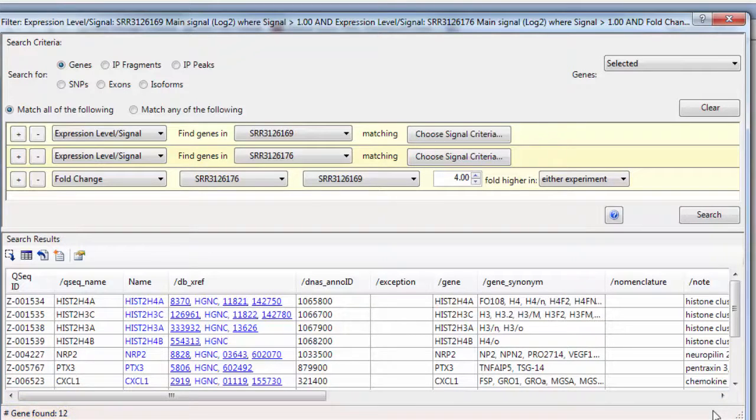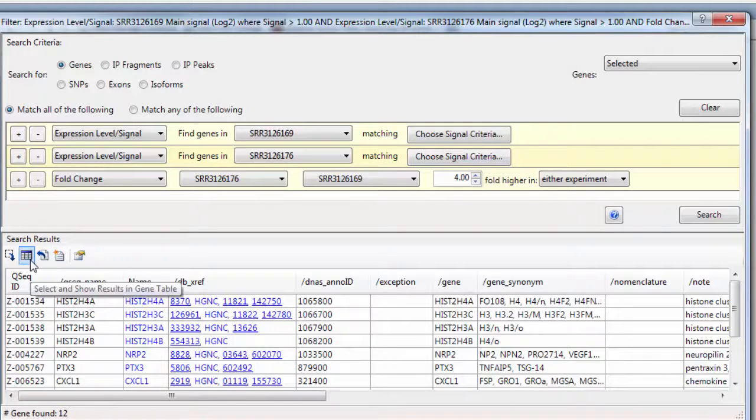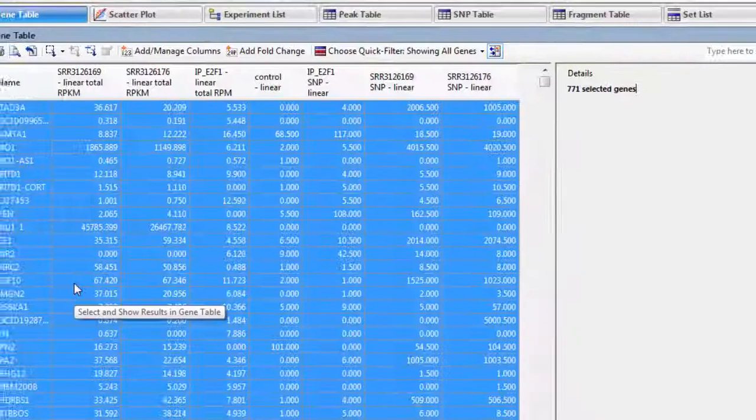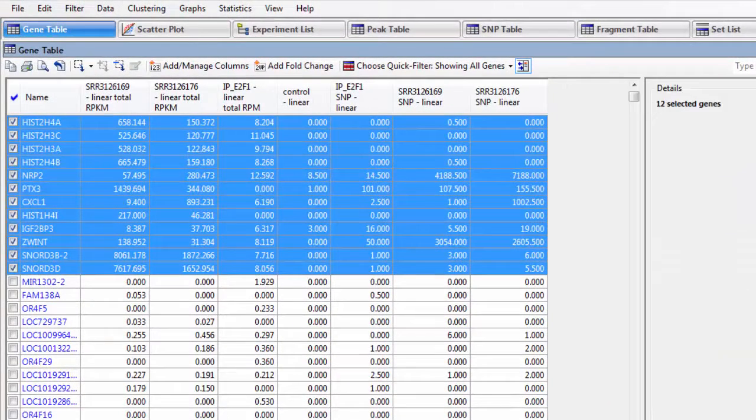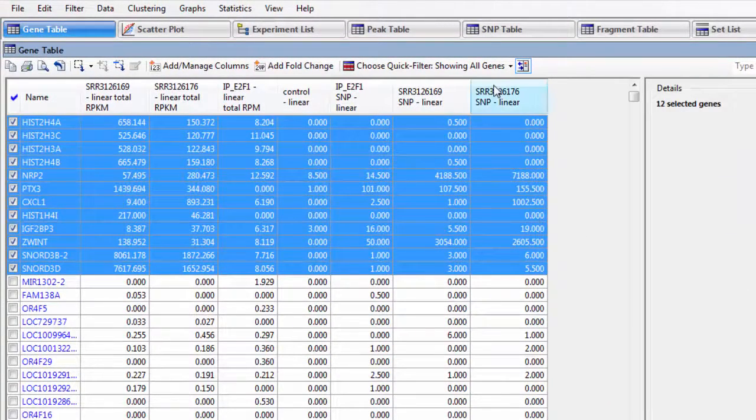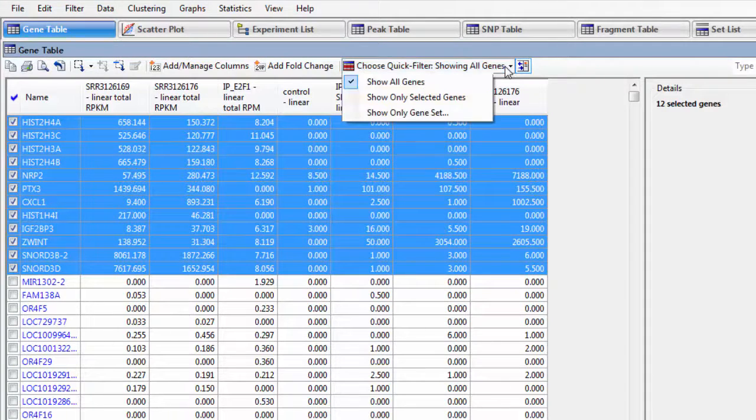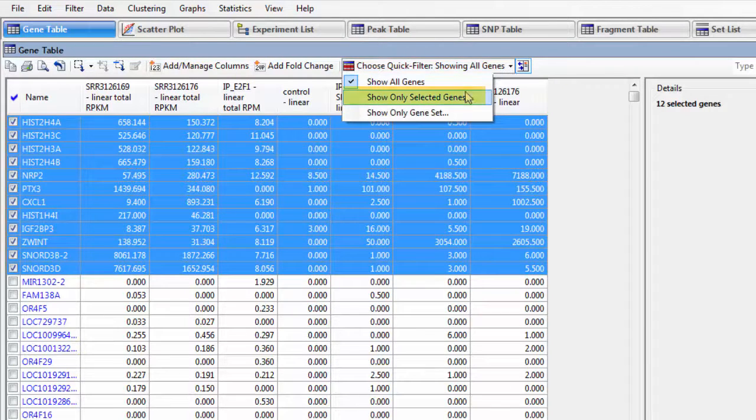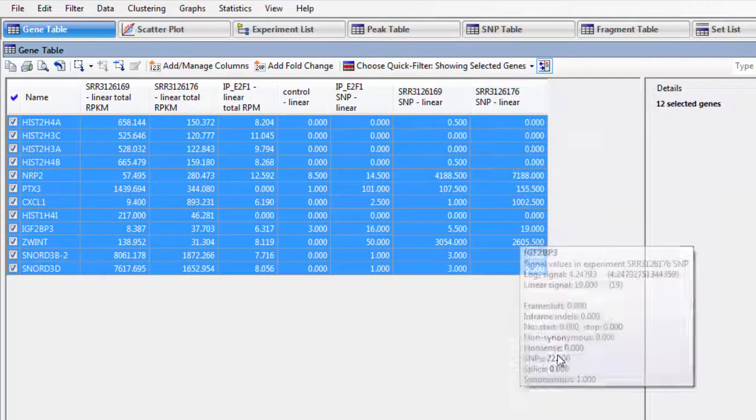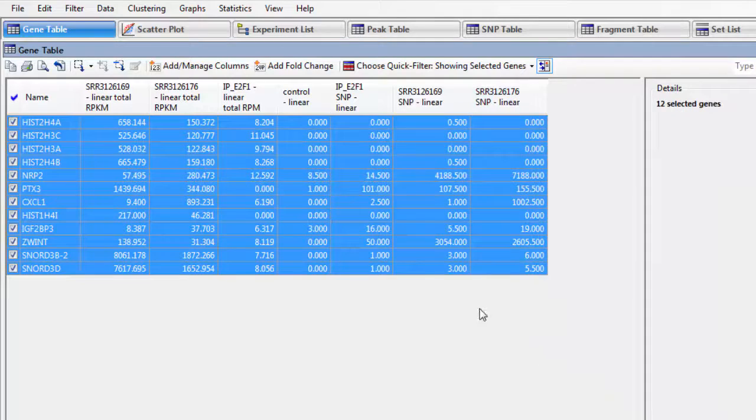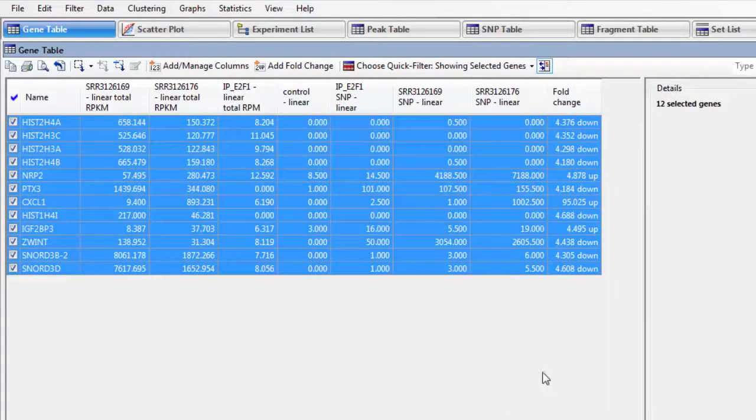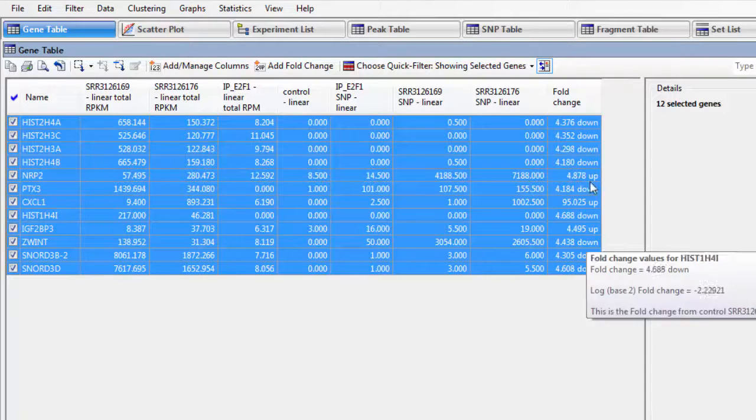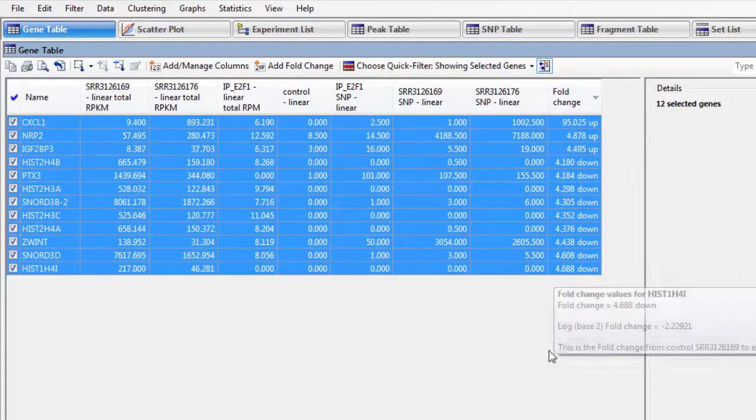I want to look at these in the gene table. So I'll click the button for Select and Show Results in Gene Table. I only want to see the genes I have selected, so I'm going to choose Show Only Selected Genes. Then I'll click on the button for Add Fold Change so I can see those values as well. And then I'm going to Sort by Fold Change.